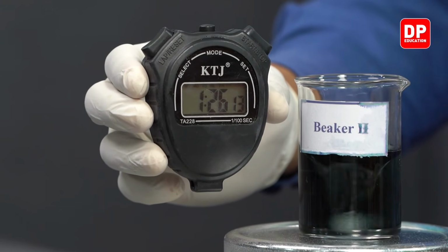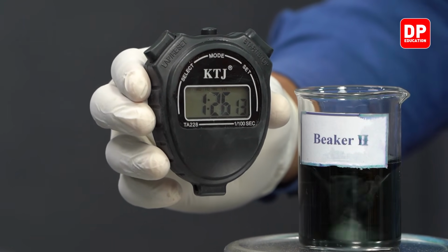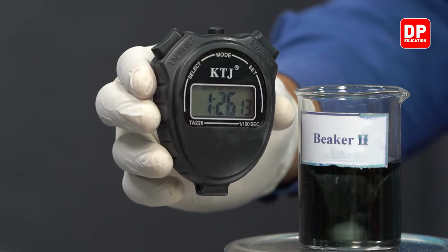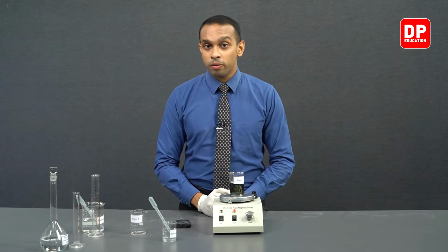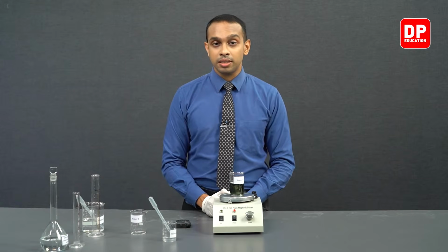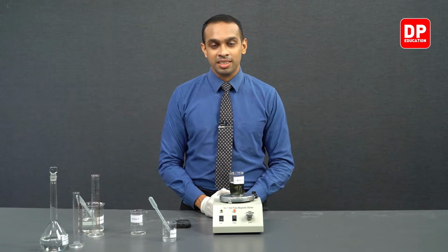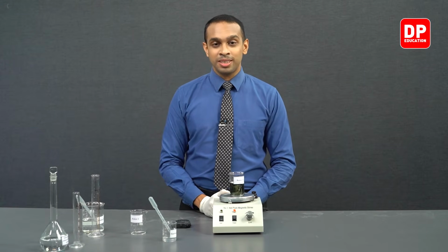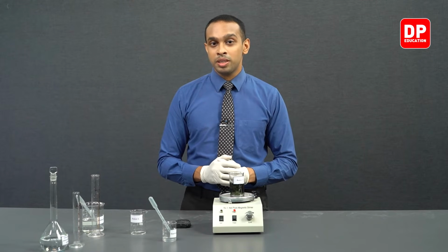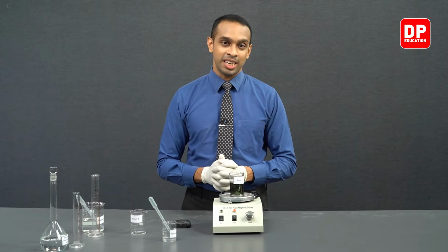So the overall time taken for this color change to appear is 86.13 seconds. So the overall time that it took for this reaction to show a color change was 86.13 seconds, or in other words, 1 minute and 26.13 seconds. Let's move on to the fifth reaction.